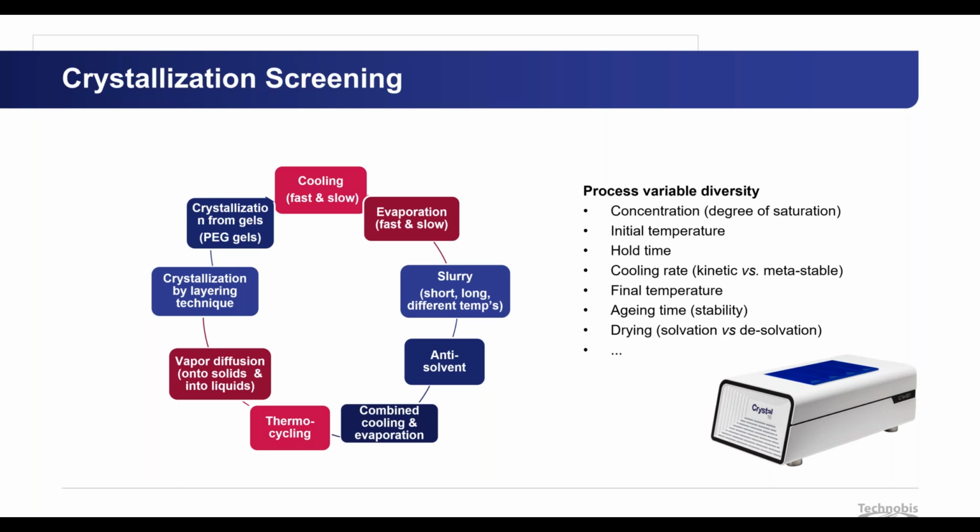Final temperature. There are different crystallization methods that you can take into account, like cooling, evaporation, crystallization from gels, layering technique, thermocycling, slurry. There are quite a few.